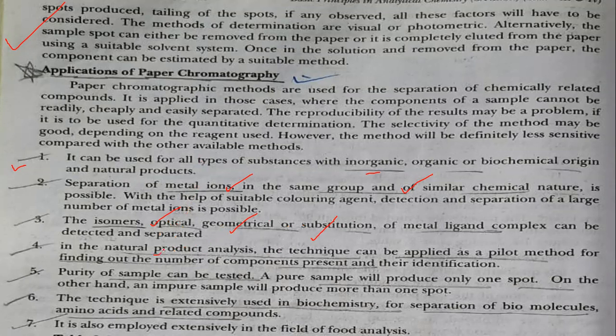Natural product analysis can also be carried out by using the paper chromatographic technique. Purity of a sample can also be tested by this technique. A pure sample will produce only one spot. On the other hand, if the sample is impure, if another entity is present, then you may get more than one spot, and that indicates that the sample we are going to use for a certain purpose has a kind of impurity in it.